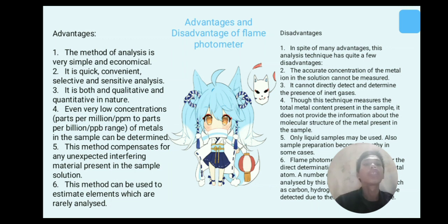Advantage and disadvantage of flame photometer. Let's go first the advantage. Number 1. The method of analysis is very simple and economical. Number 2. It is quick, convenient, selective, and sensitive analysis. Number 3. It is both qualitative and quantitative in nature.